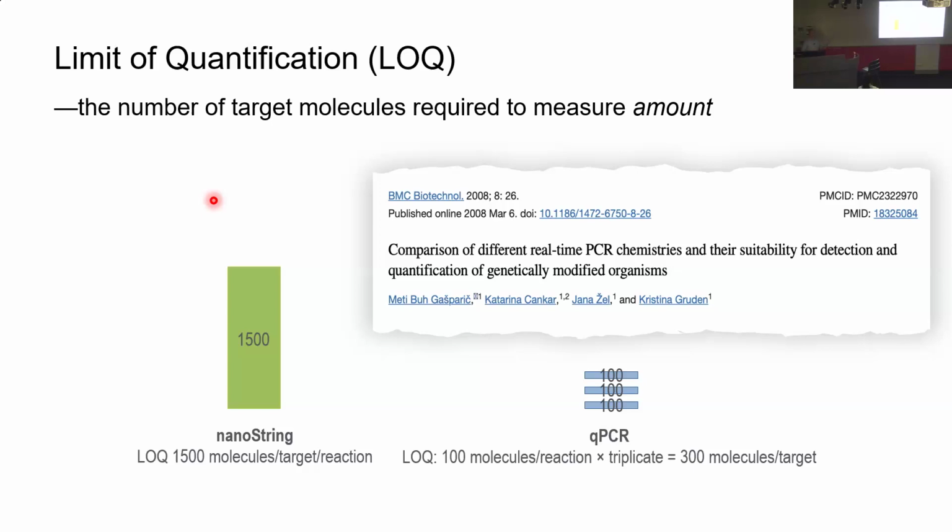And that's a big number. It's probably more like 1,000, but it's up in that range, right? So straight away you'd say, oh, well, nanoString's hopeless. It's actually zeptomole sensitivity, okay? 2 zeptomoles. That's incredibly sensitive, but the PCR is only 100 molecules. You go, oh, I'm going to stick with PCR. But you need to run 3 replicates. So there's 300 molecules per gene.